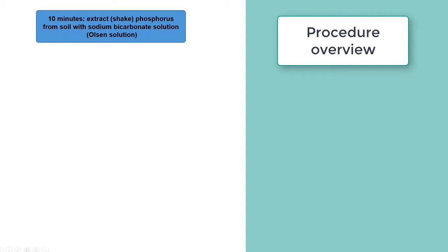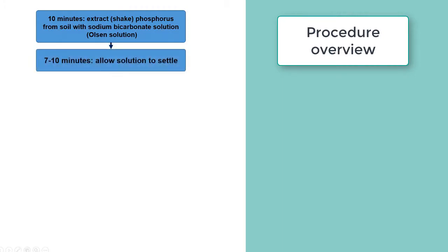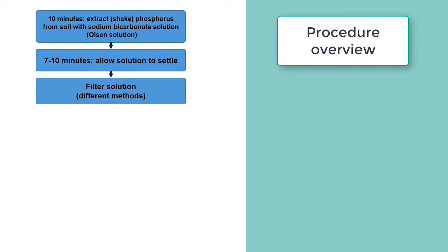We allow that solution to settle for 10 minutes so that some of the clays settle out, to prepare it for filtration. Then we filter the solution — there are two methods for that — which gets rid of the rest of the clays in the solution, making it a clear solution.